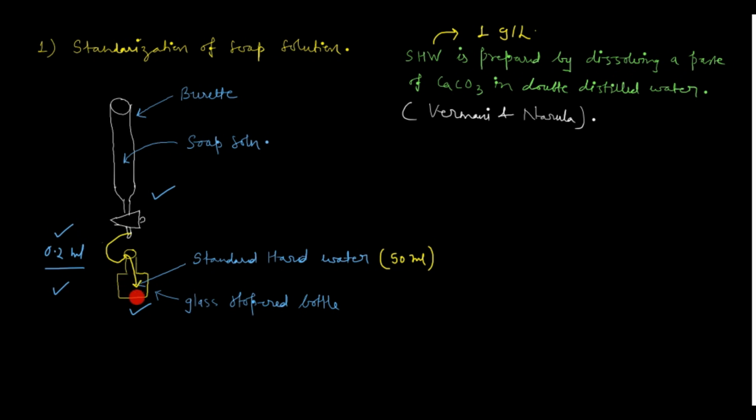If it is not forming lather, then in the next step I will again add 0.2 ml, shake vigorously, and again observe whether lather formation is happening or not.